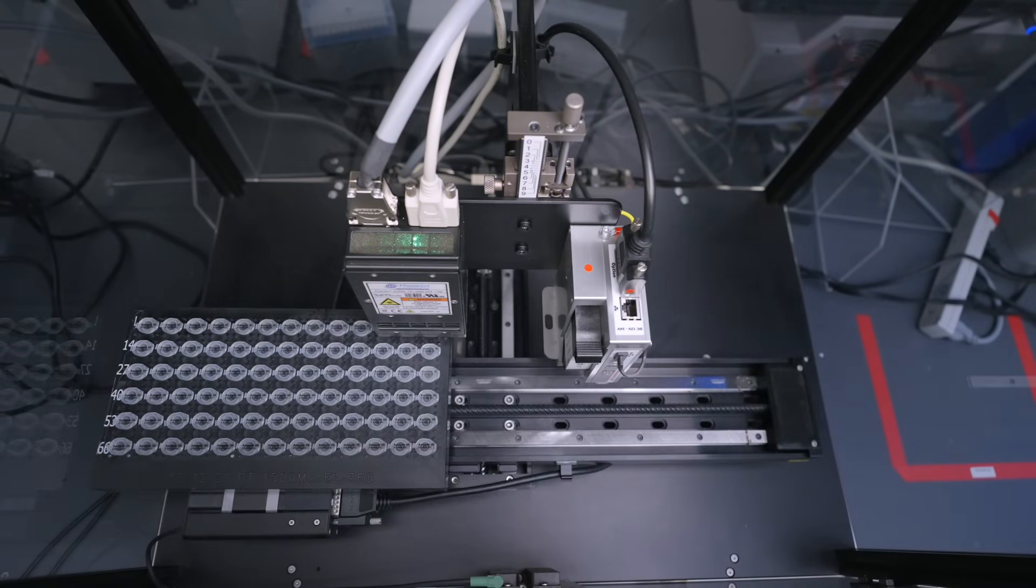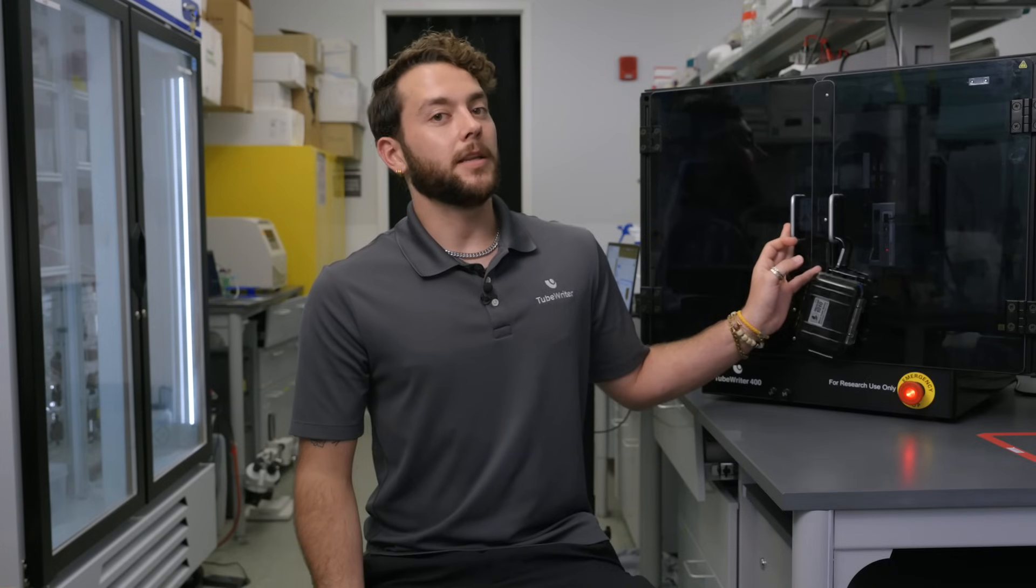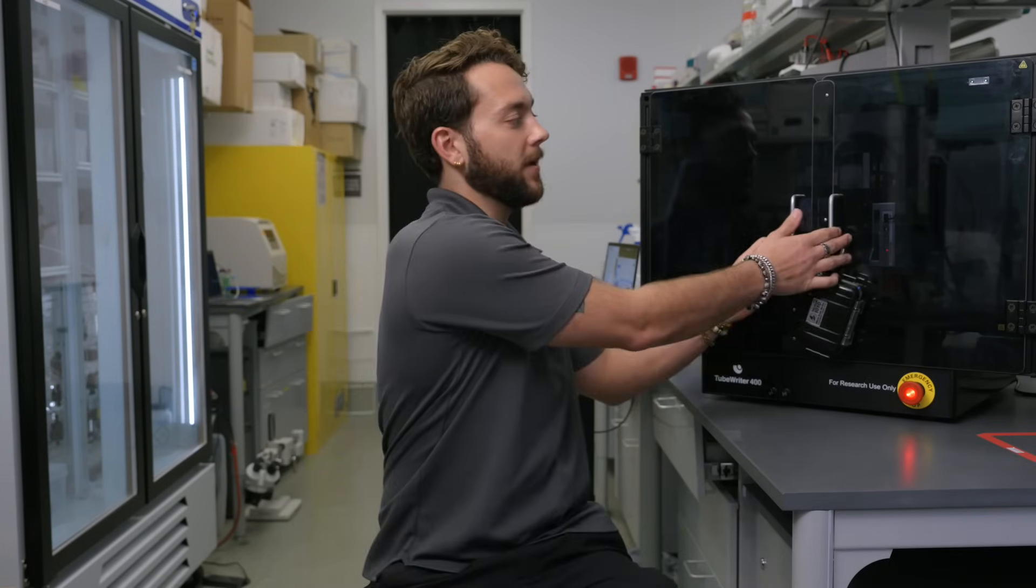Now it's done printing. I'll go ahead and pop it out of the system.